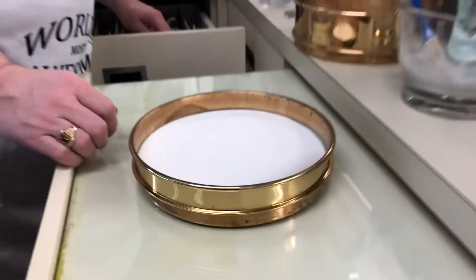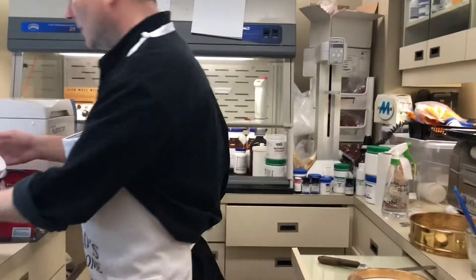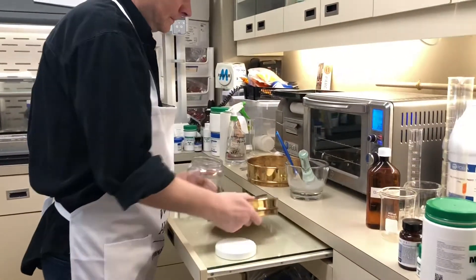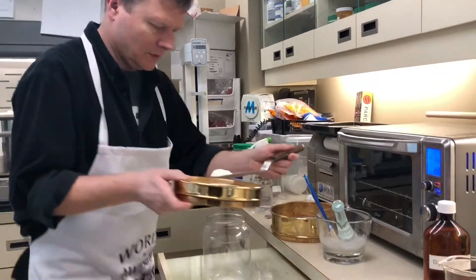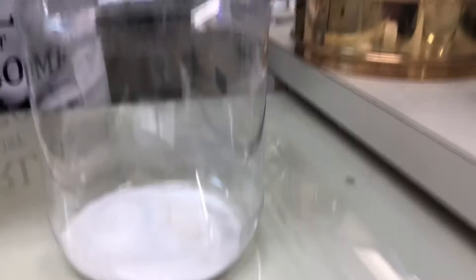Now that is not mixed together yet. To do that, we're going to use our inversina again. We could just put it back into the mortar and pestle, but mixing it with the inversina is my favorite way of doing that. So if you want to have a look over here, we'll fill the inversina jar.